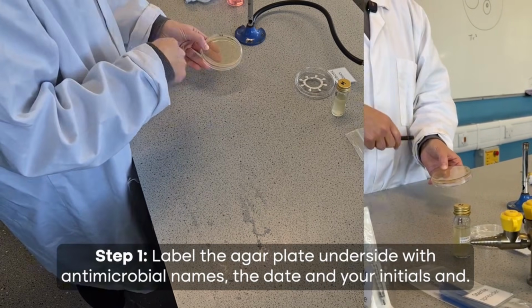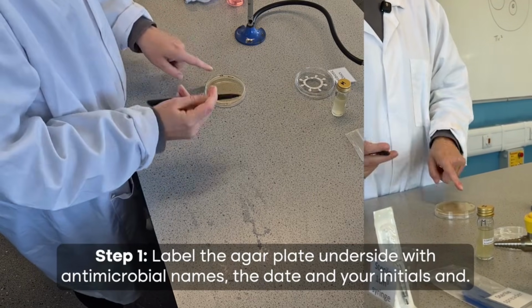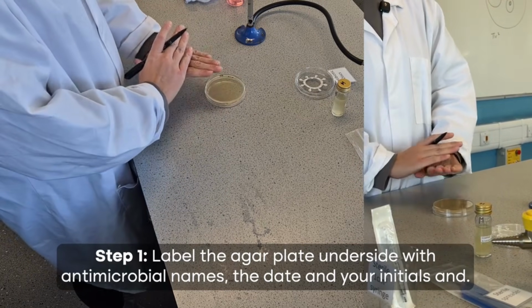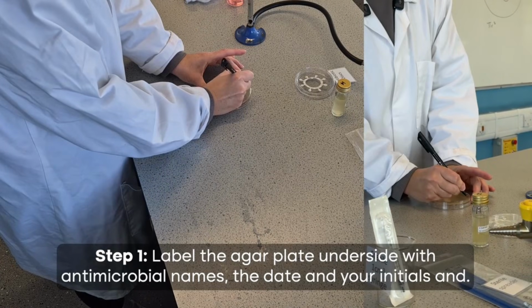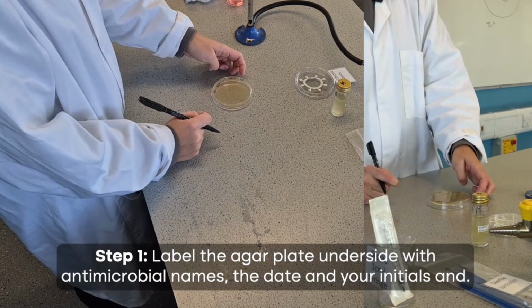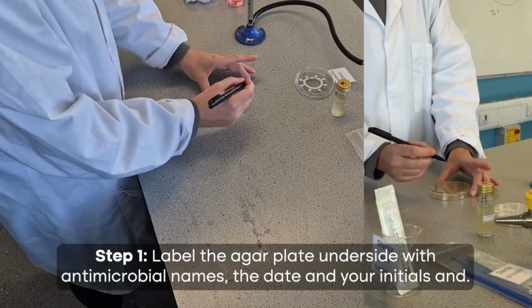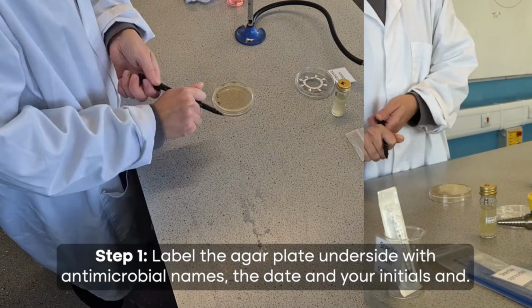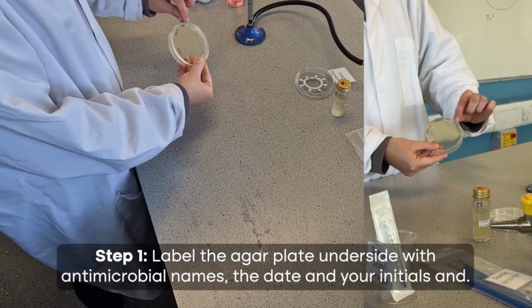Because I'm now going to be adding in something else, you have to add in what is going into the plate, and we do it around the edge so it's not going to block our results at the end. I'm going to put my initials as well, so the students should put their initials because in the class they need to be able to identify which are theirs. And I'm adding E. coli. So that is now my new label that I'm adding to the bottom, at the corner, at the bottom.